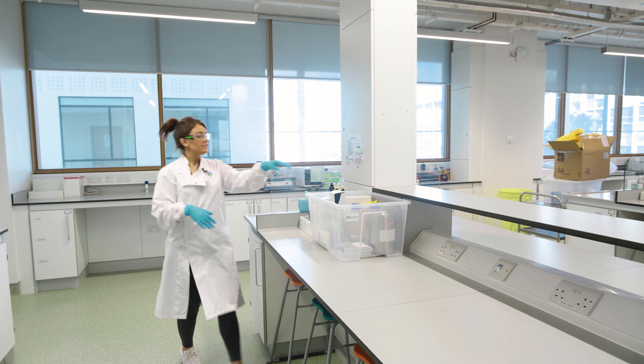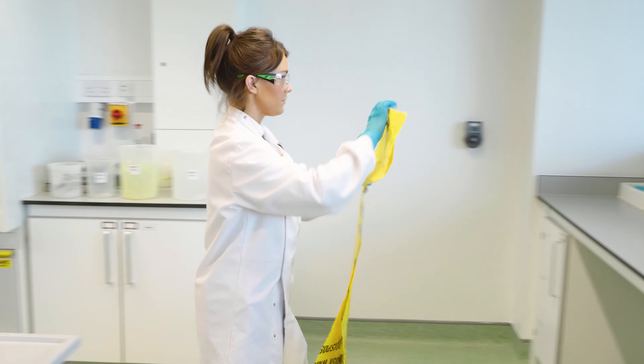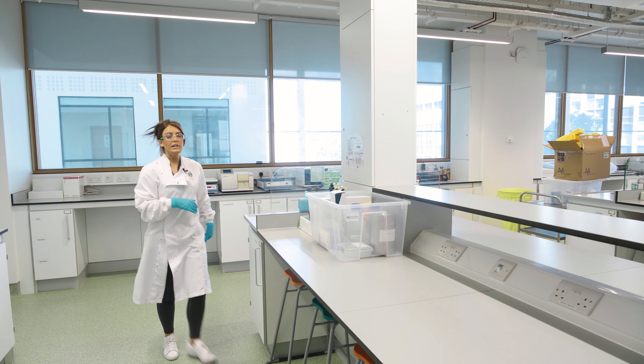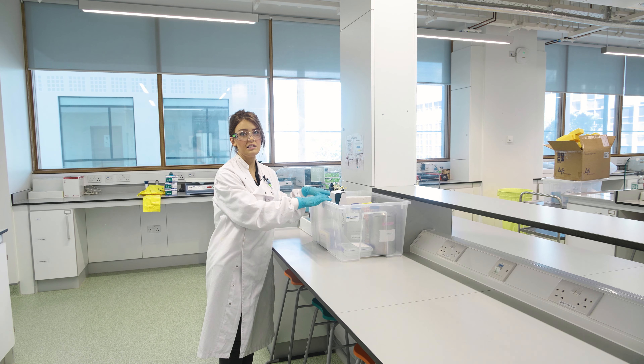Along with the gloves, we've also given you a bin bag to put them in, so you should leave this at the top of your bench. Only the gloves can go in that bin bag. You'll get a separate bag for your gels when you finish the gel electrophoresis.